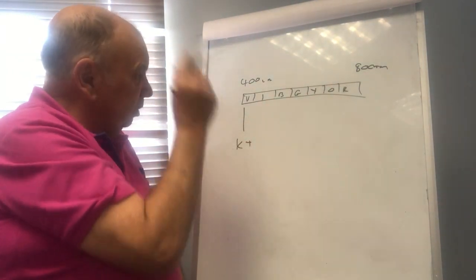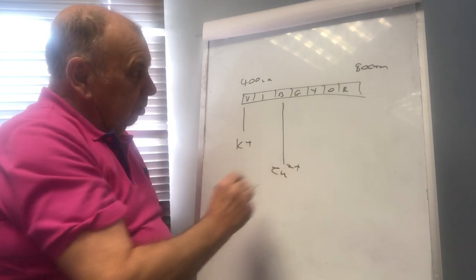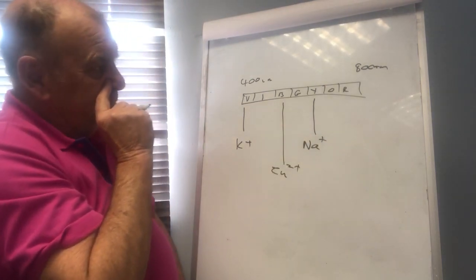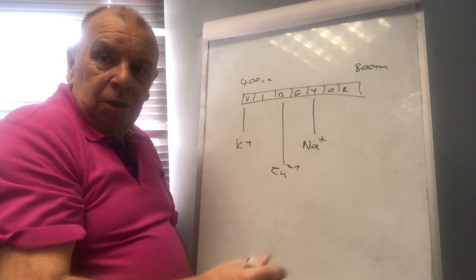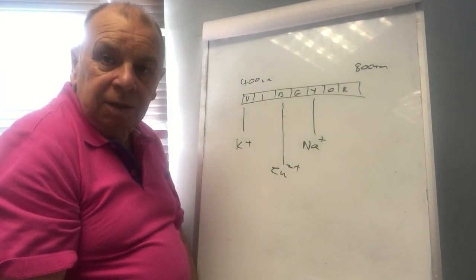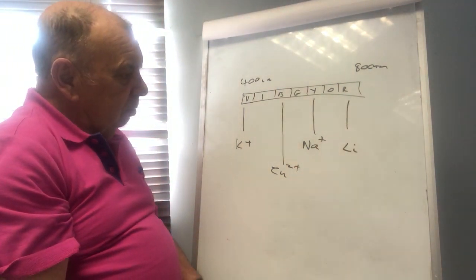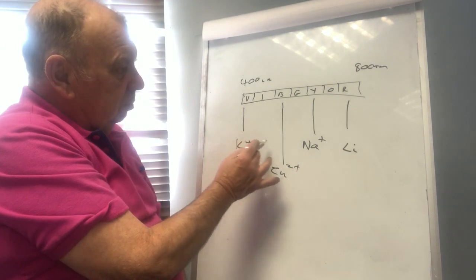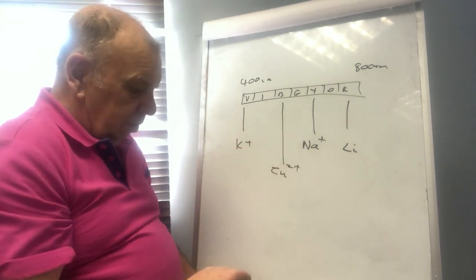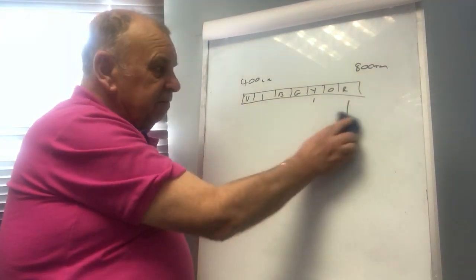That would be potassium. Bluish or greenish, that would be copper ions. Yellow, sodium ions. Crimson, lilac here, crimson there as in lithium round there. So I've done that, haven't I? Copper, one more, potassium, I just can't think about it. Okay, something like that. And that is the principle of flame photometry.